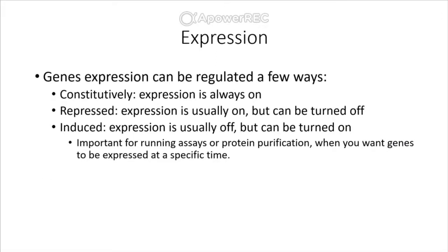Okay, we've come a very long way. We PCR'd our gene of interest, including restriction enzyme sites on the ends of that gene, the flanking regions, that match up with restriction enzyme sites in our plasmid, so that we can take our gene of interest and our plasmid and do a restriction digestion with our two enzymes, and then we can ligate them together. Then we followed that up with a transformation and a selection. So now that we only have bacterium that have our plasmid present, now we're ready for expression.